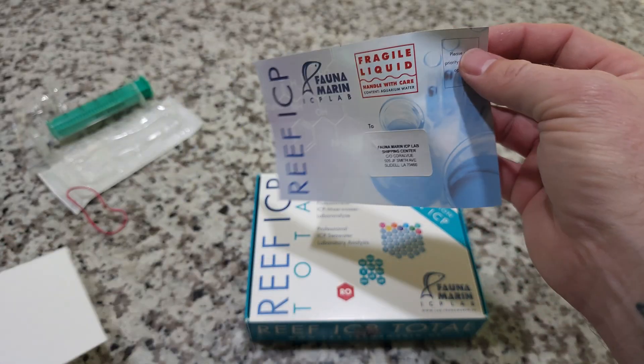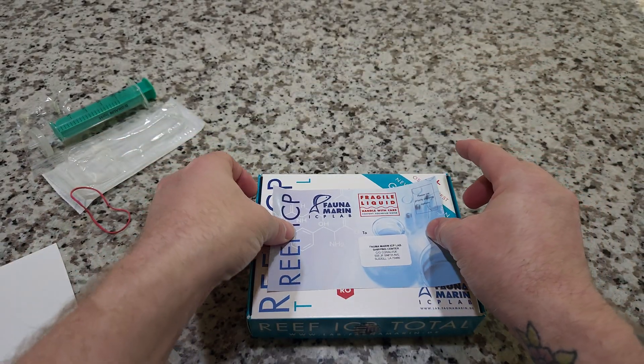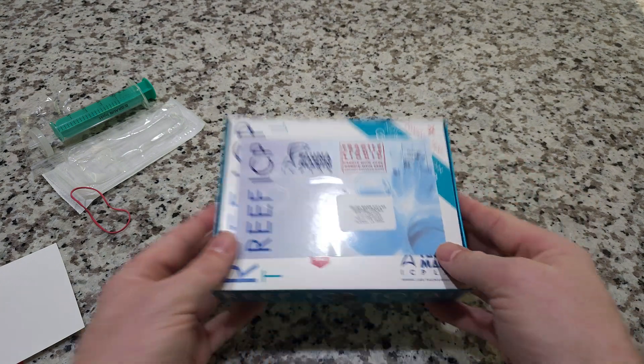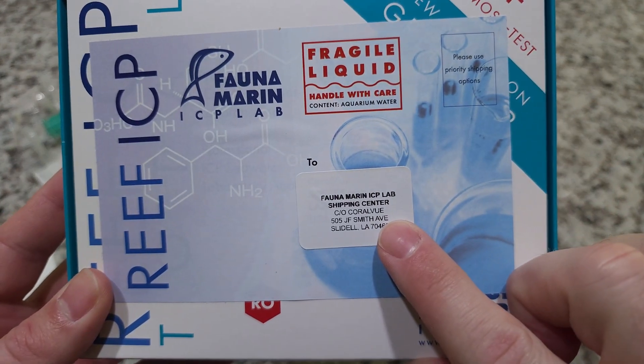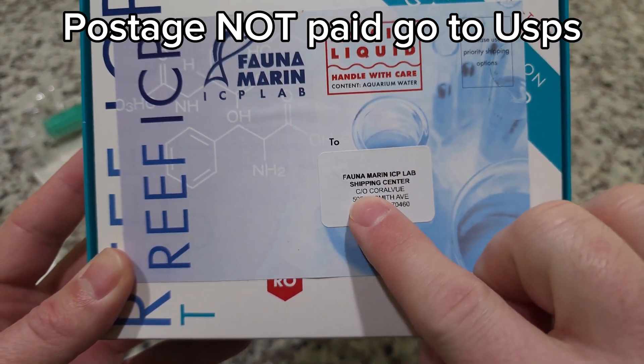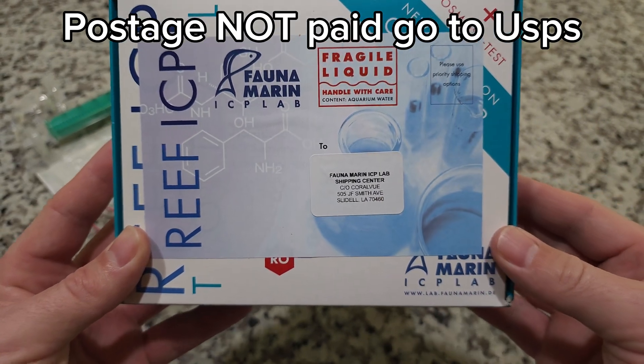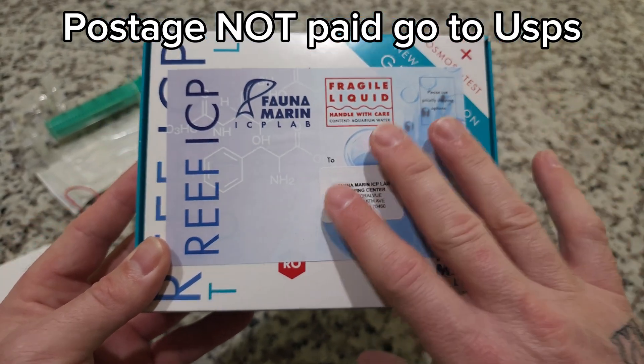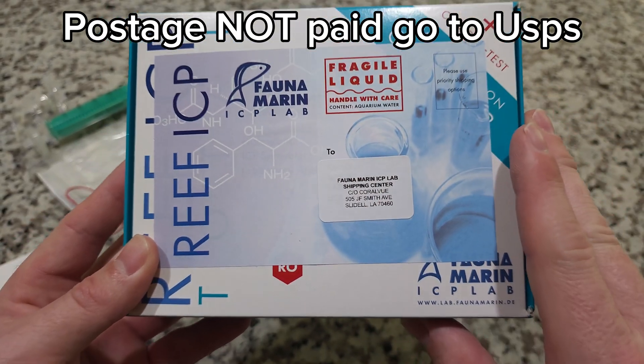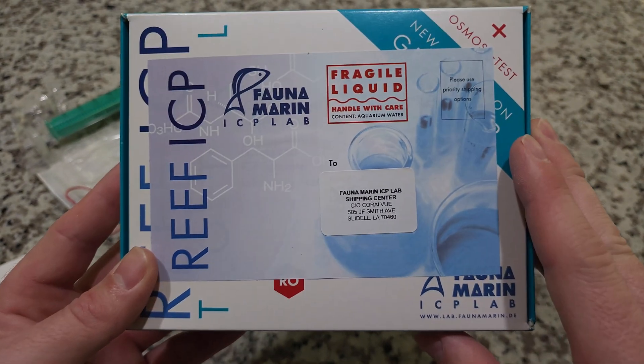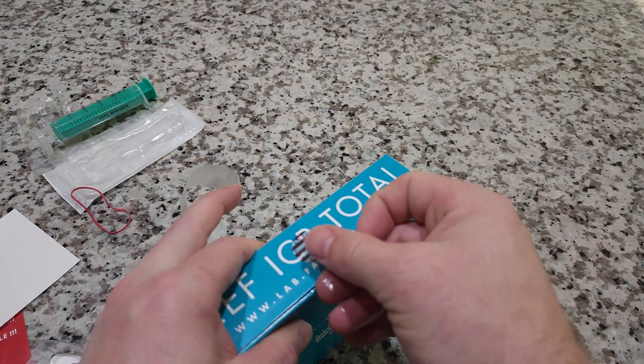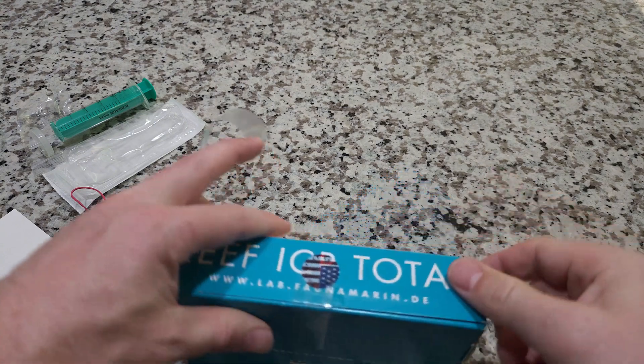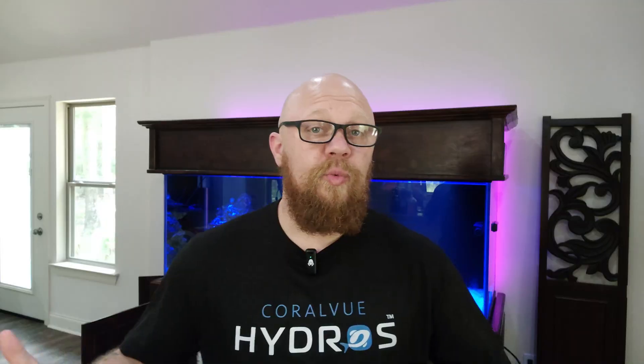Let's peel this off, stick this label right to the front. As you can see it already has the address of the local place where this needs to be shipped. Fauna Marine ships these off to Germany three times a week so you're actually going to get your results back pretty fast. Don't forget to pop a quick piece of tape on for good measure.